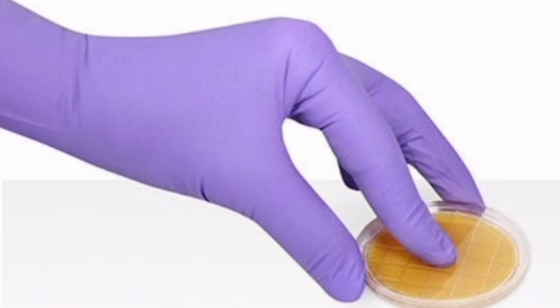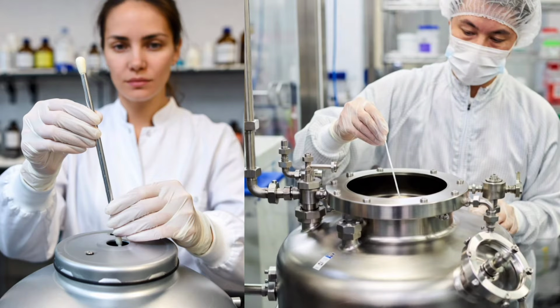Next one is surface monitoring. There are also two types there: one is swab sampling, another one is contact plate method. Contact plate is used to monitor flat surfaces, but swab is used for irregular or non-flat surfaces. This sampling is taken over a 5 by 5 centimeter square.